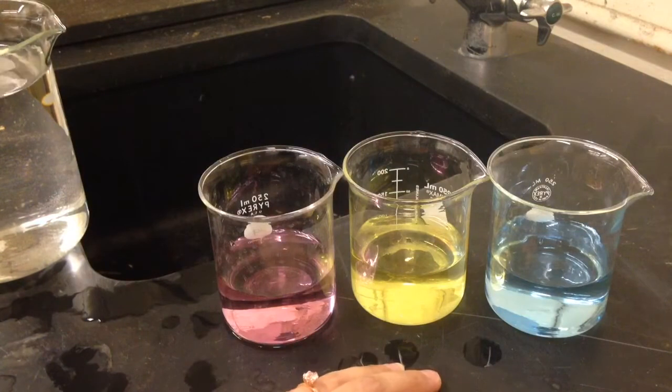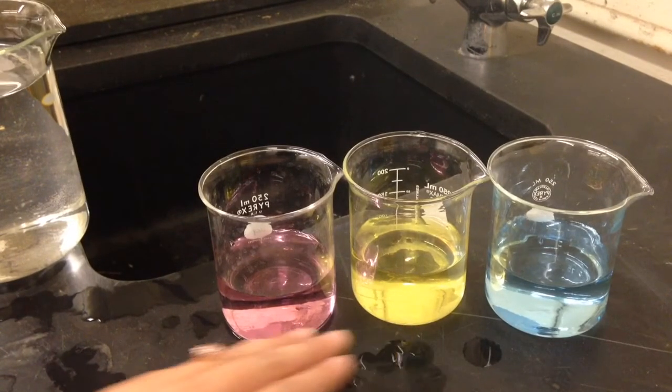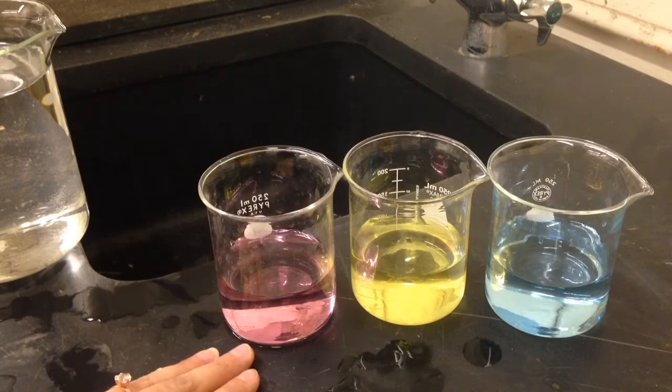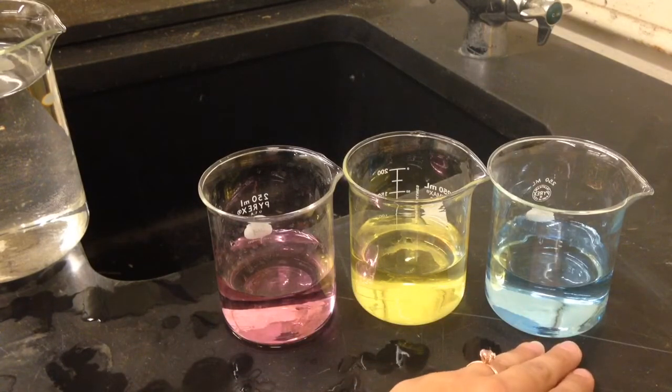We also need three smaller containers filled with pH calibration standards or buffers. We need a neutral solution with a pH of 7, an acidic solution with a pH of 4, and a basic solution with a pH of 10.